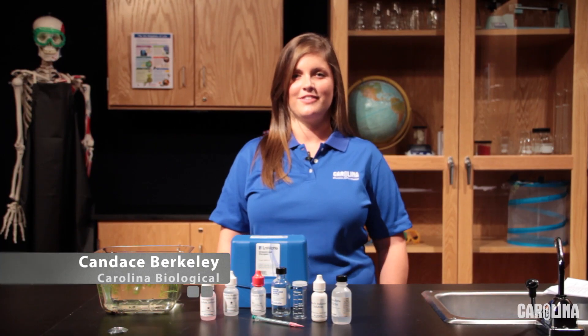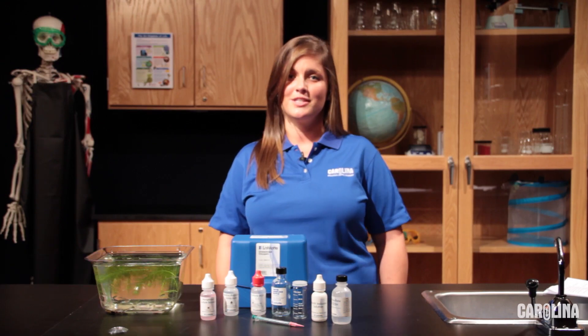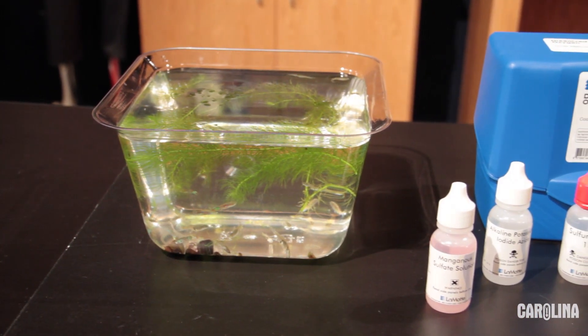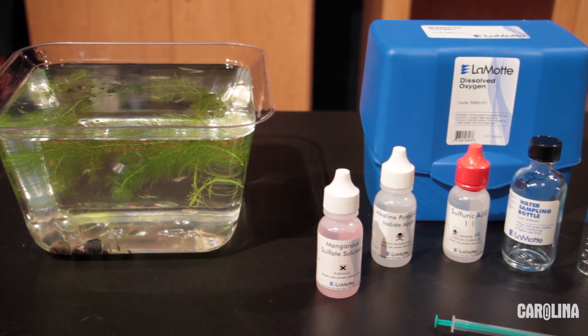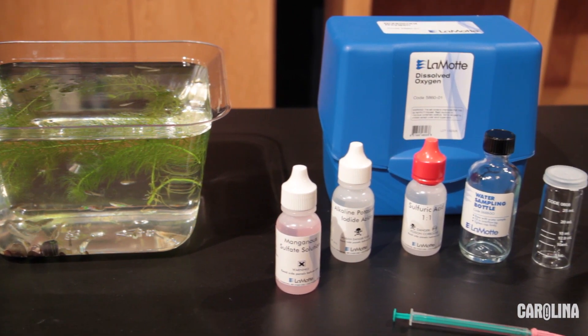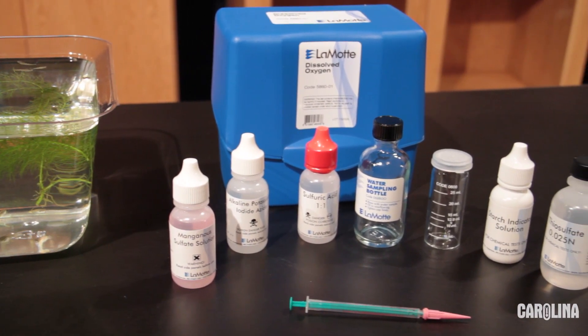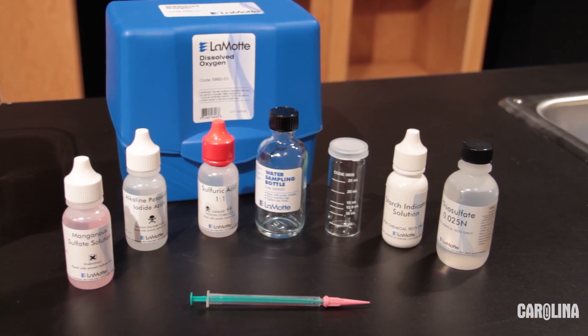Hi, I'm Candace Berkley, Development Coordinator for Life Science at Carolina Biological Supply Company. Today I'm going to demonstrate and discuss the process of the Winkler method to test for dissolved oxygen in water samples using Lamott's Dissolved Oxygen Kit. The Winkler method is a technique used to measure the concentration of dissolved oxygen in freshwater environments. Dissolved oxygen content in aquatic systems is critical to the water's ability to support life and is also an indicator of the health of the system. Instead of using a test tablet, this technique allows students to gain hands-on experience fixing samples on-site and performing titrations.